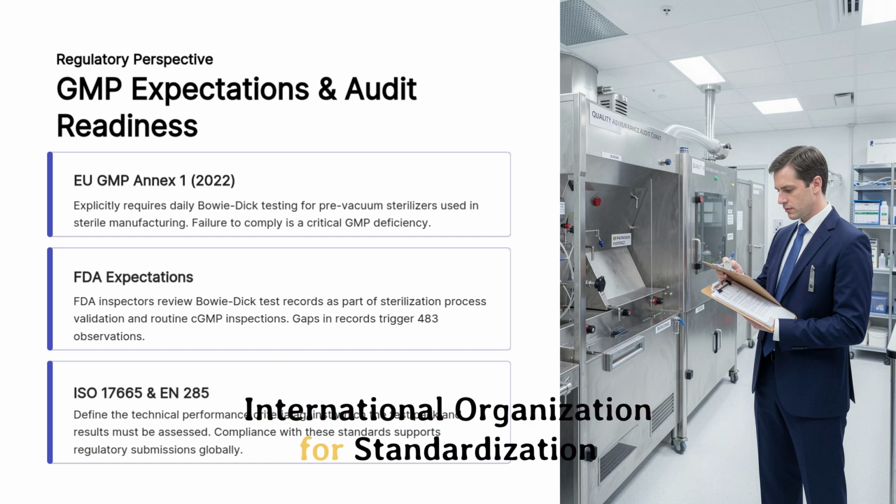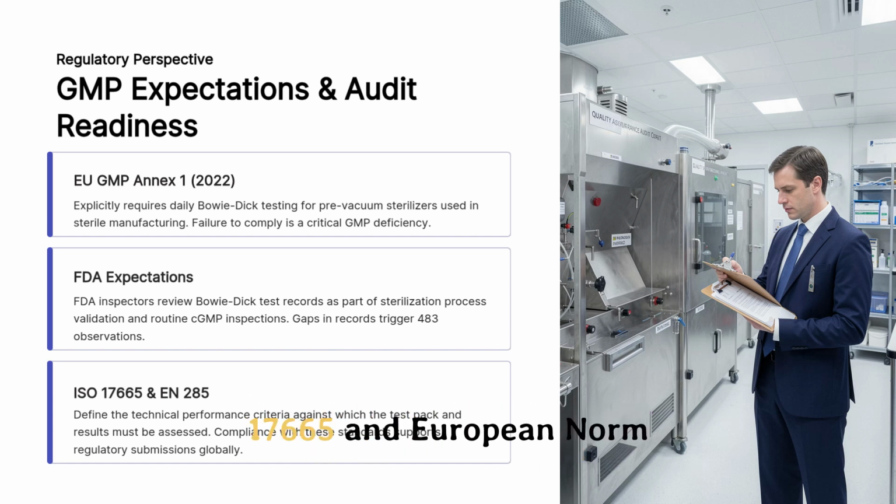International Organization for Standardization 17665 and European Norm 285 set the technical criteria for assessing test packs and results, aiding global regulatory submissions.